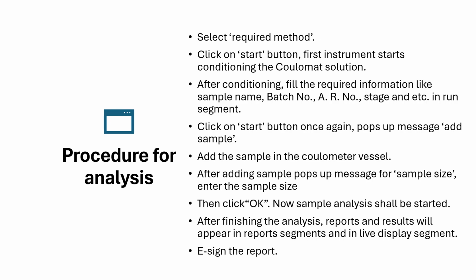After finishing it, you can e-sign the report if you have an automated system, and finally you can take a print of the report. This is the overall procedure for analysis by using the coulometer.